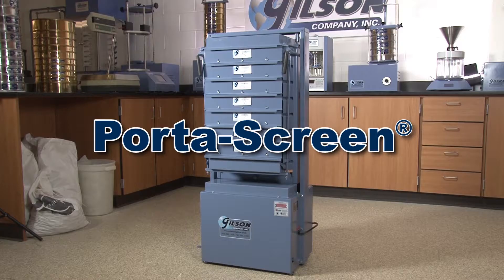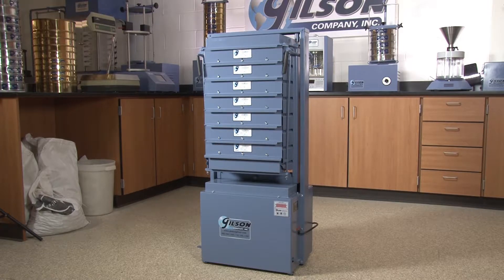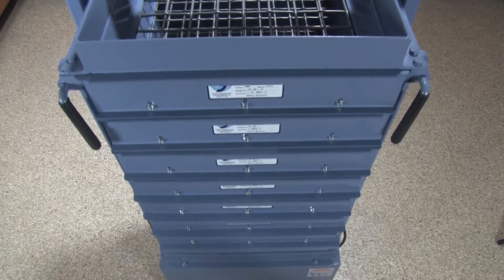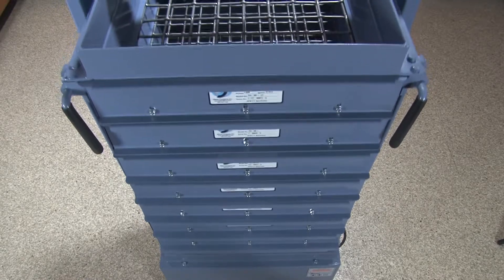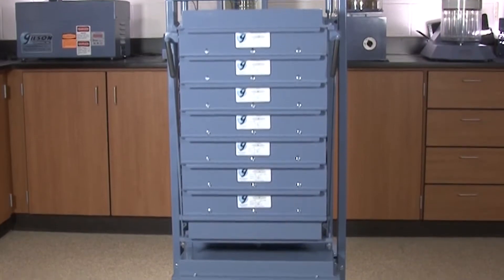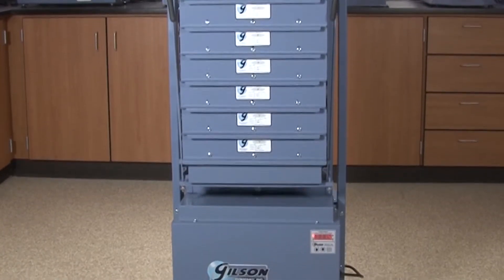The Gilson PortaScreen is a rugged, lightweight, portable solution for particle size determinations. These lightweight, sturdy machines are designed for performance, durability, and mobility, and also have a counterbalance drive system for smooth operation.